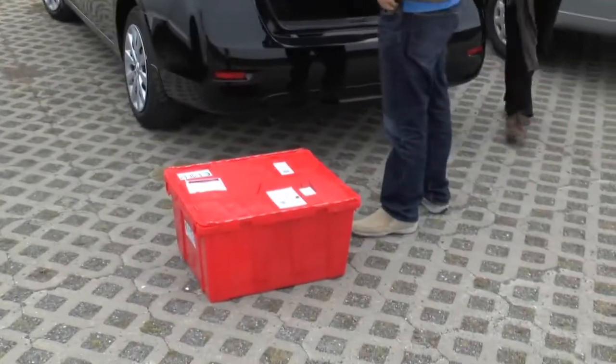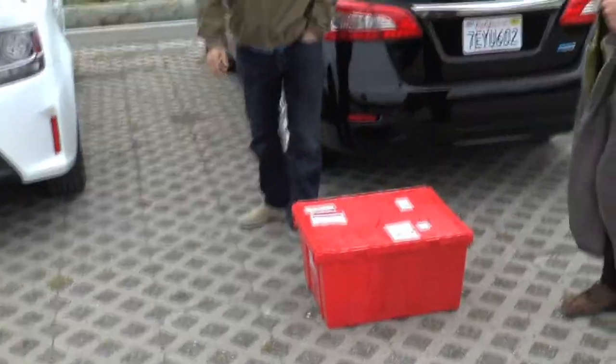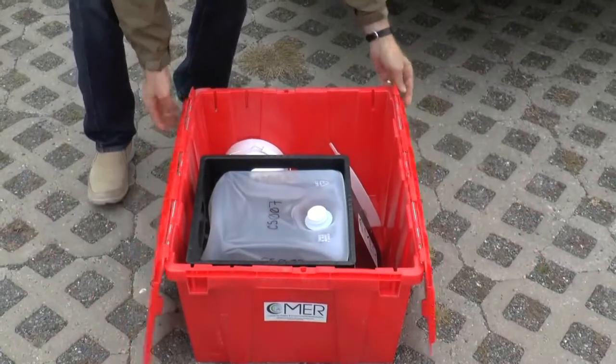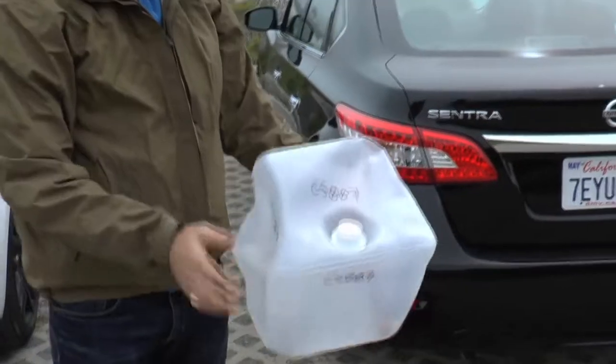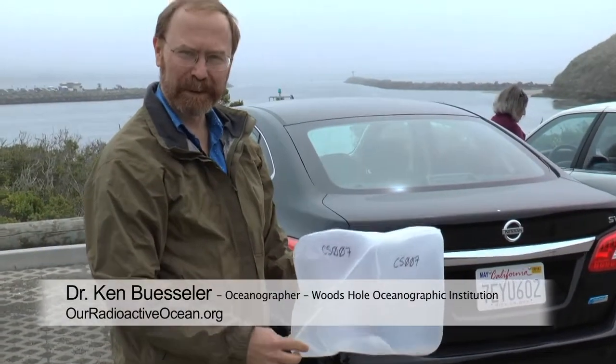Mario, good to see you. This is the kit. This is how we're going to collect the water. This cubitainer — collapsible containers — holds about 5 gallons or 20 liters.